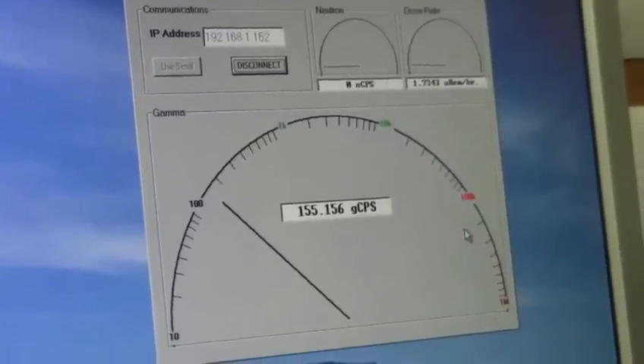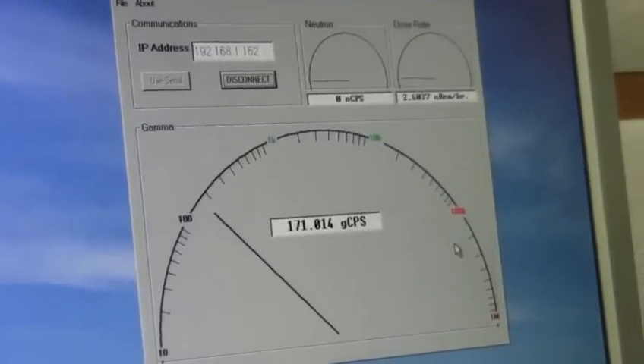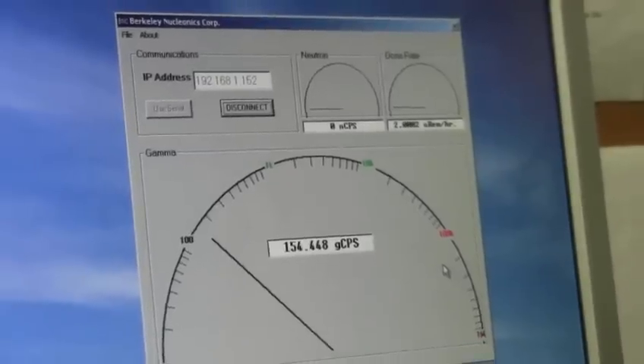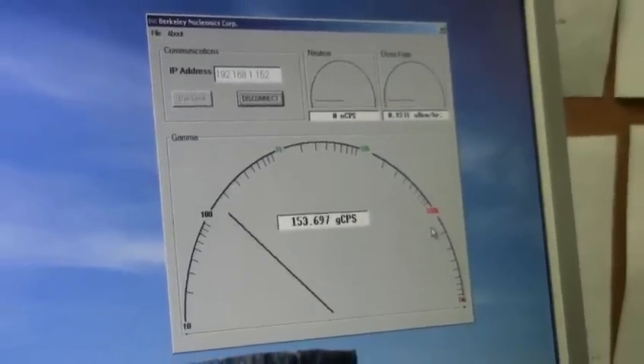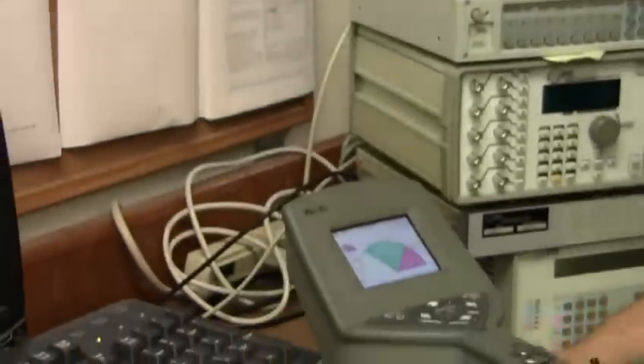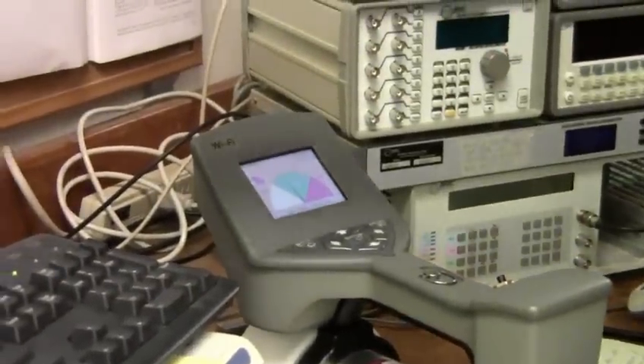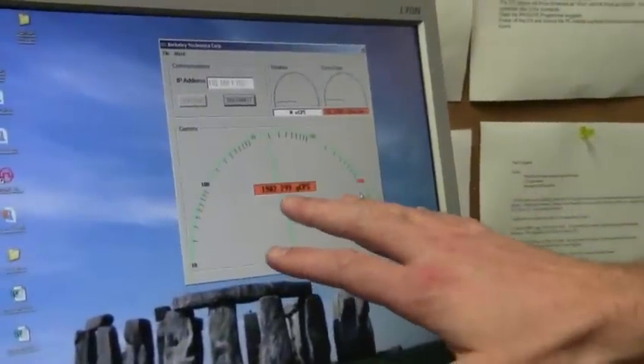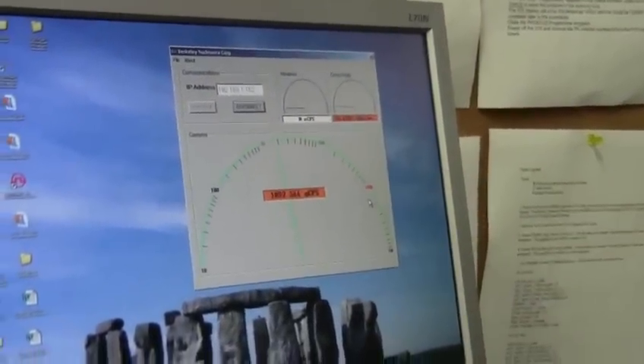Background in our area here is quite low — a couple hundred gamma counts per second. We can introduce now a source. I'll put my source on the detector and we see right away that both on the instrument and the computer application, the count rate shoots way up.